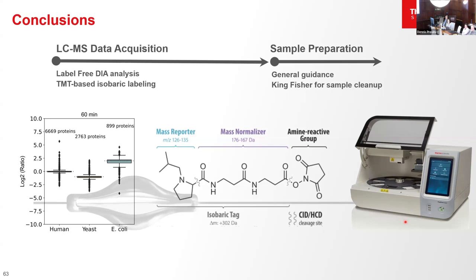It's something you really can't do with the O-Link or the SOMA methods. You get a data output, whether it's on a graph or a cell in an Excel spreadsheet. It's a number. You get numbers out of the mass spectrometry data too, but you can always go in and evaluate: do I feel like this is a real measurement or not? And so that comfort.